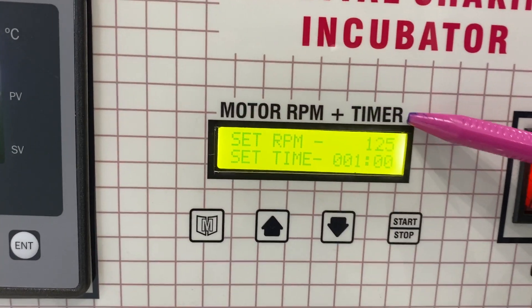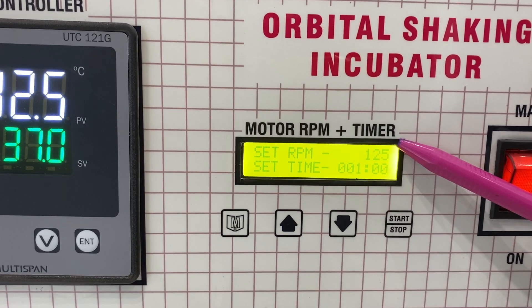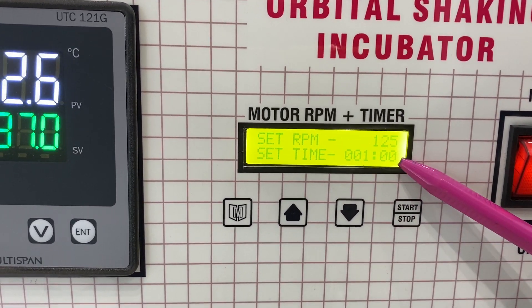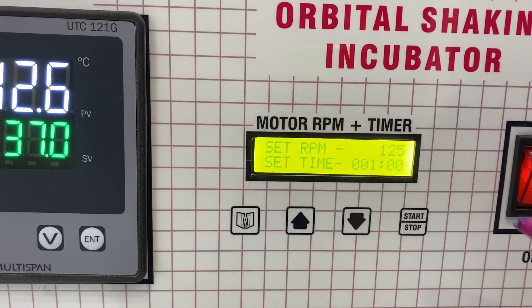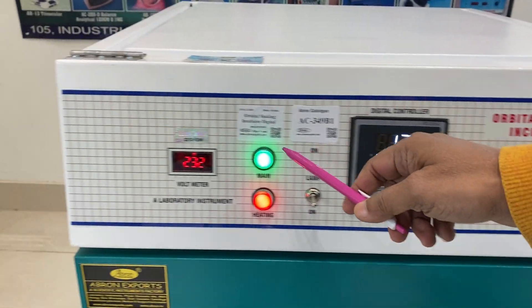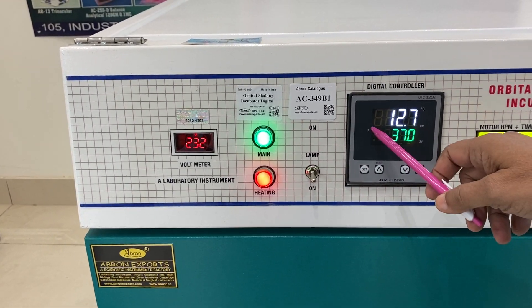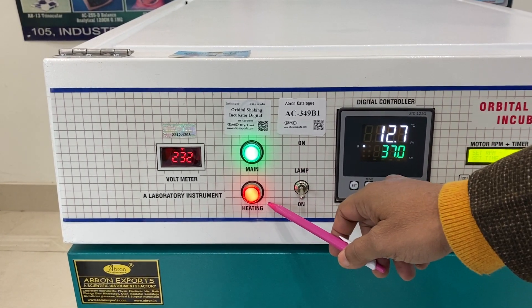We have the temperature controller here. This is the RPM and timer board where the RPM speed and set time are controllable. The set time has been done for one minute. Now let me tell you about the panel: this is the main on indicator, and this indicator tells you heating is going on.